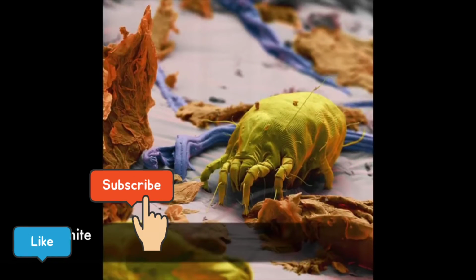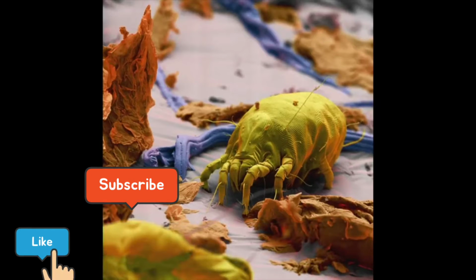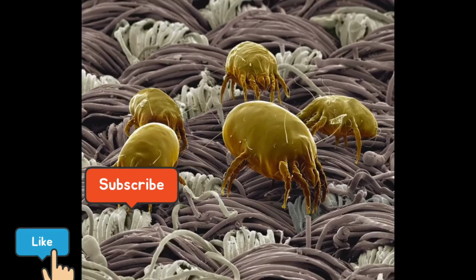Dust mites have unsegmented round bodies with mouth parts that are highly adapted to feeding on the dead scales of human skin found in household dust. They have 8 legs and are relatives of spiders and scorpions. They are smaller than a full stop and therefore invisible to the naked eye. Millions of dust mites live inside furniture and fabric in the average home. The dead bodies and excrement of dust mites can cause allergic reactions to household dust.